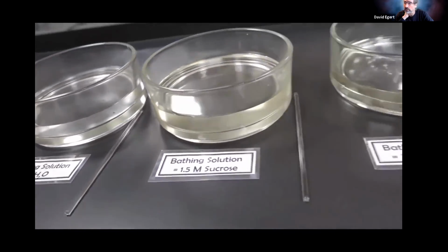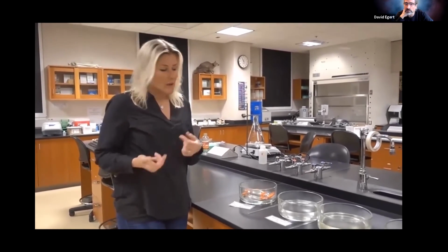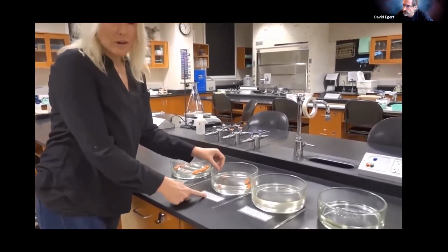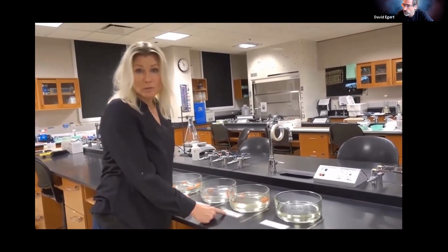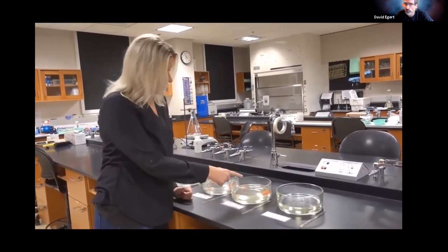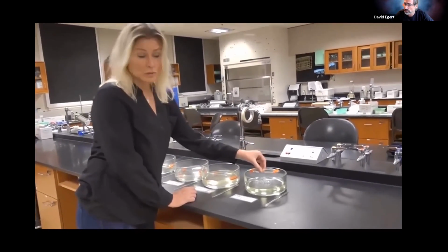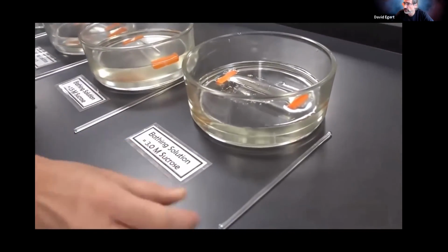As you remember, in osmosis, water is going to move from a low solute concentration to a high solute concentration. Another catchy way to remember that is that water chases solutes. So I'm going to put one of these into distilled water, one into 1.5 molar sucrose solution, which is the same as the inside of the sausage. Remember, all of the sausages have 1.5 molar sucrose solution. And then this last one goes into 3.0 molar sucrose solution.